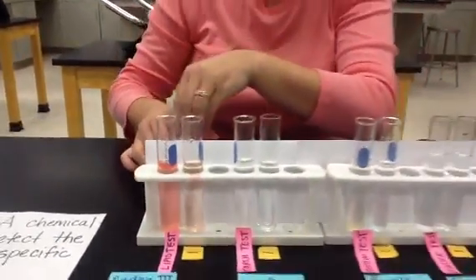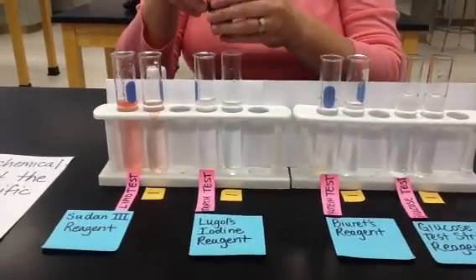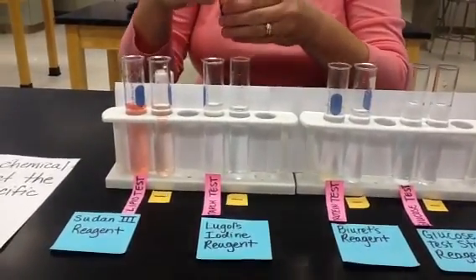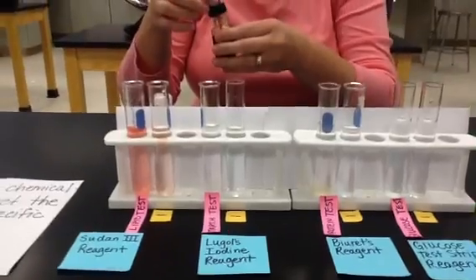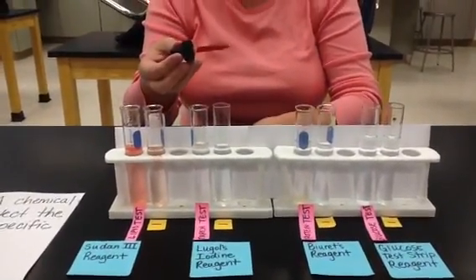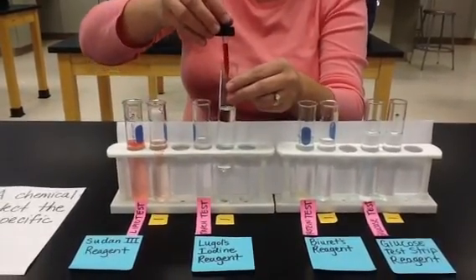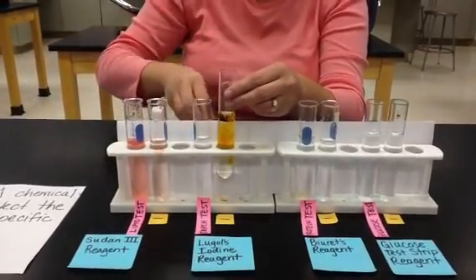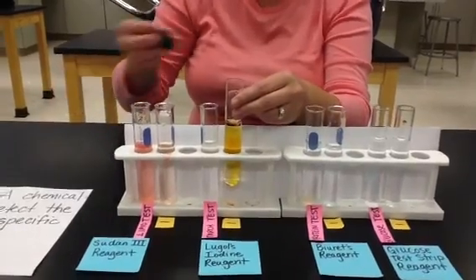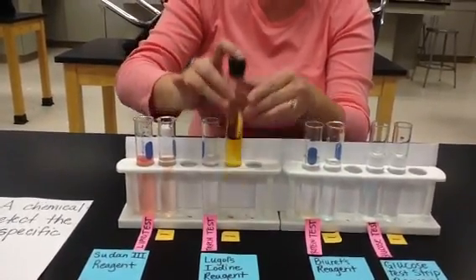Our next one is our starch test, and we use Lugol's iodine reagent to test for the presence of starch. So we're going to start with our negative test. If it's a negative test, it's going to be the same color as our original reagent, which is kind of this light brown and maybe even pale yellow. So let's see what we get here.